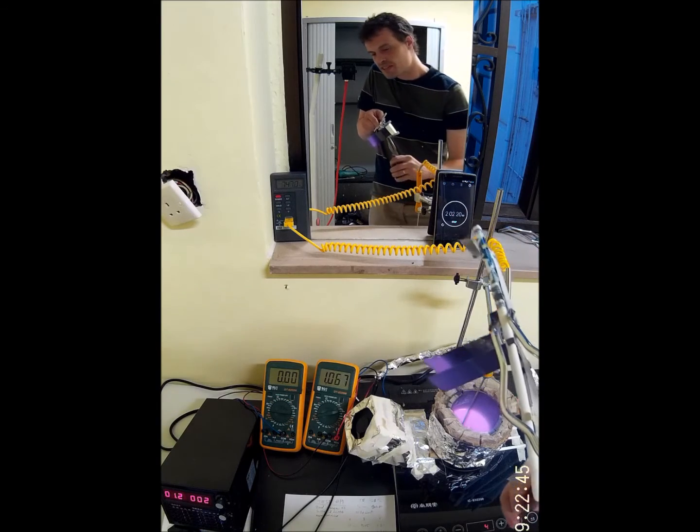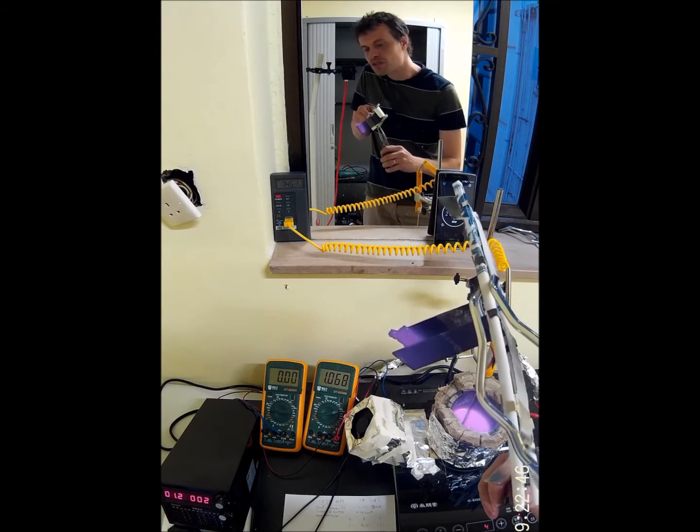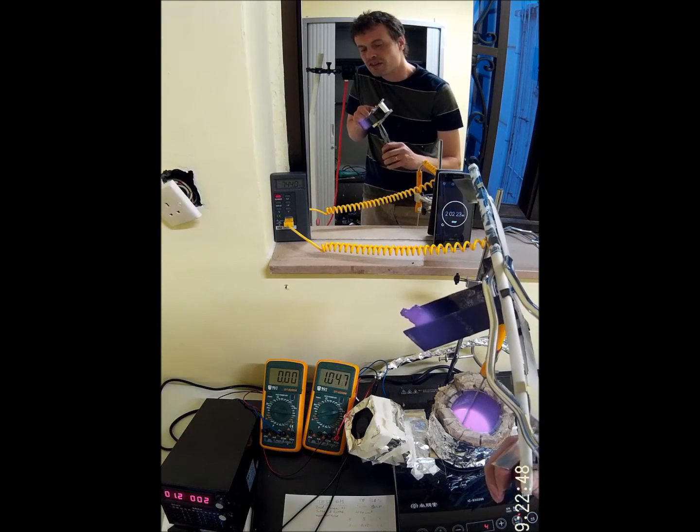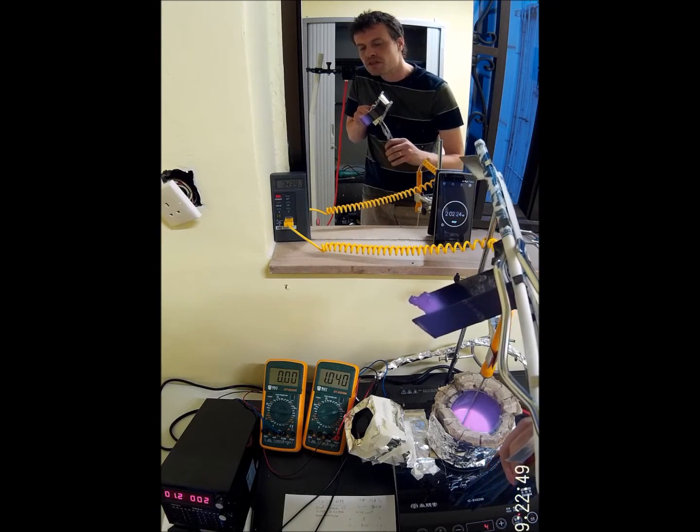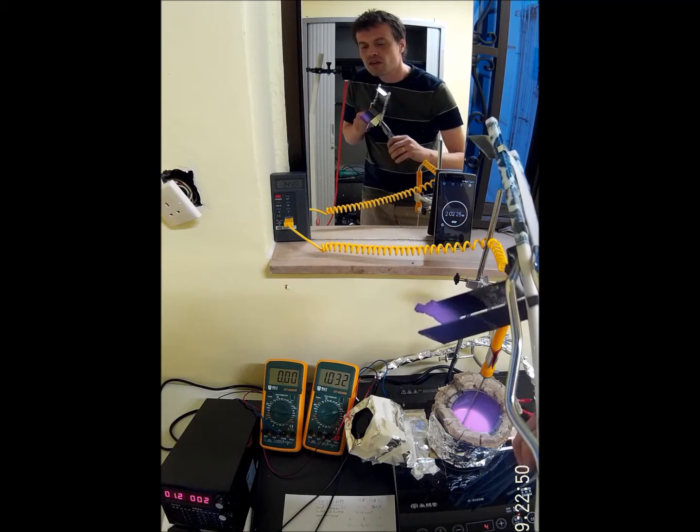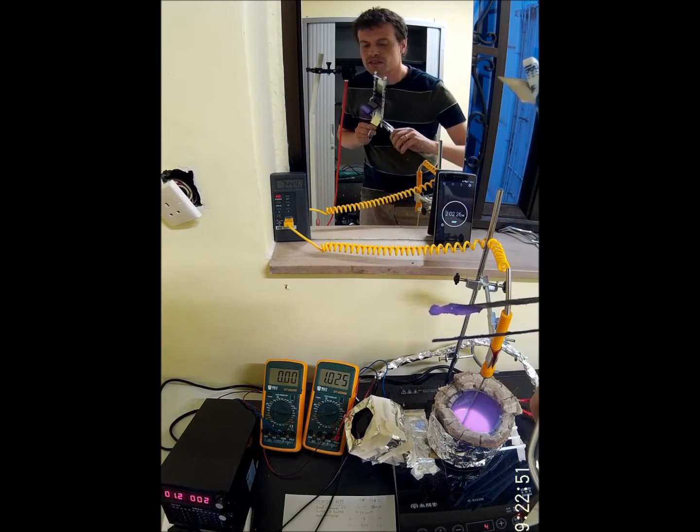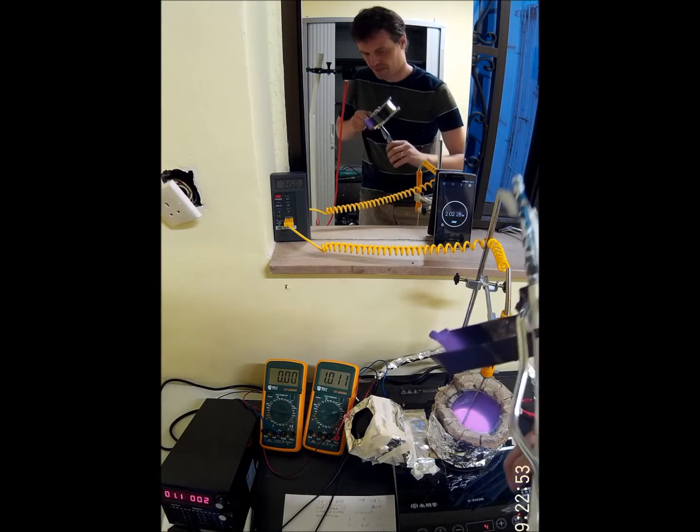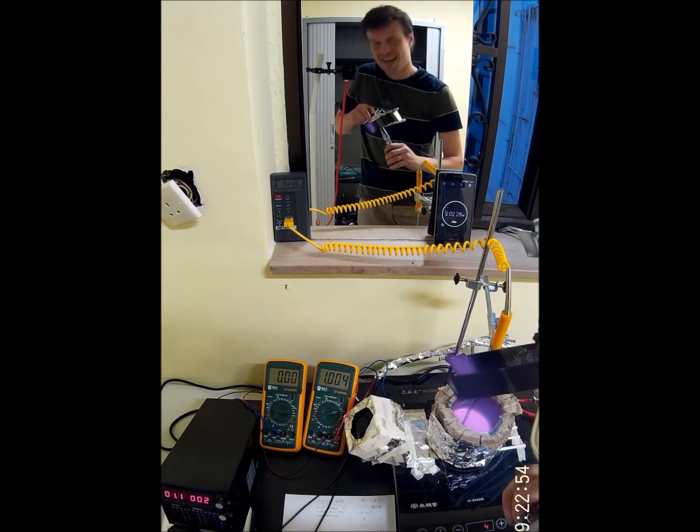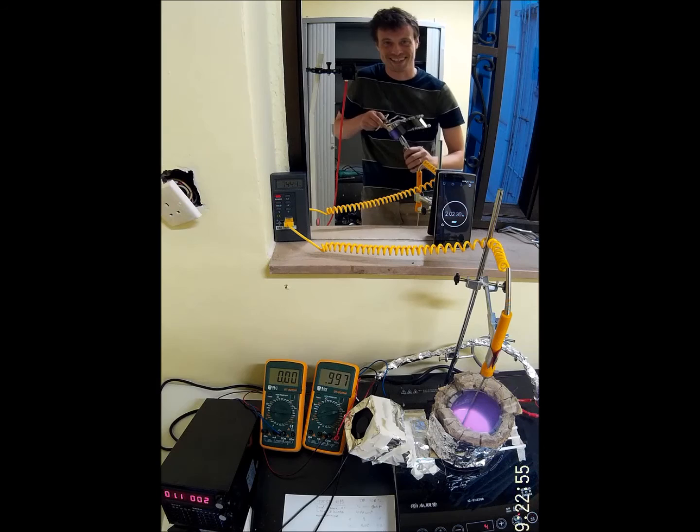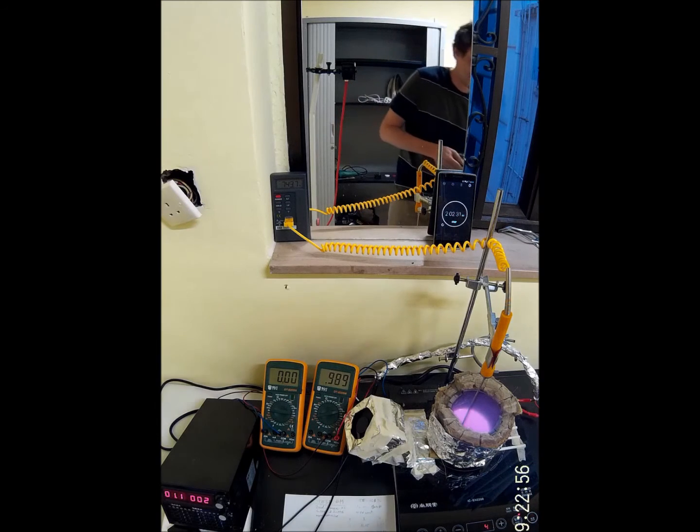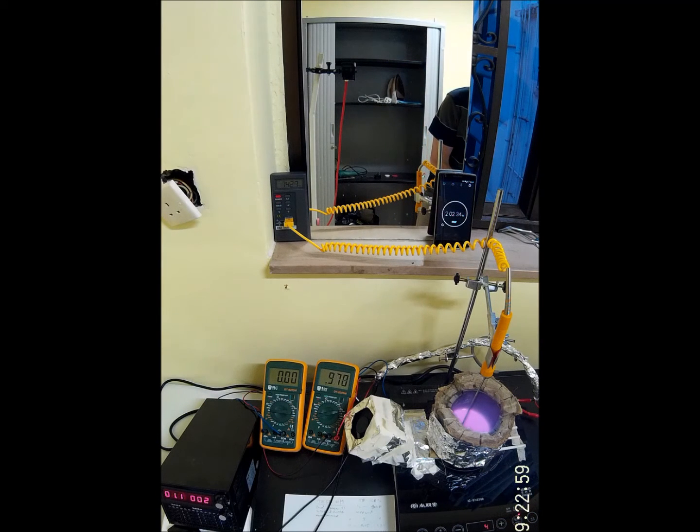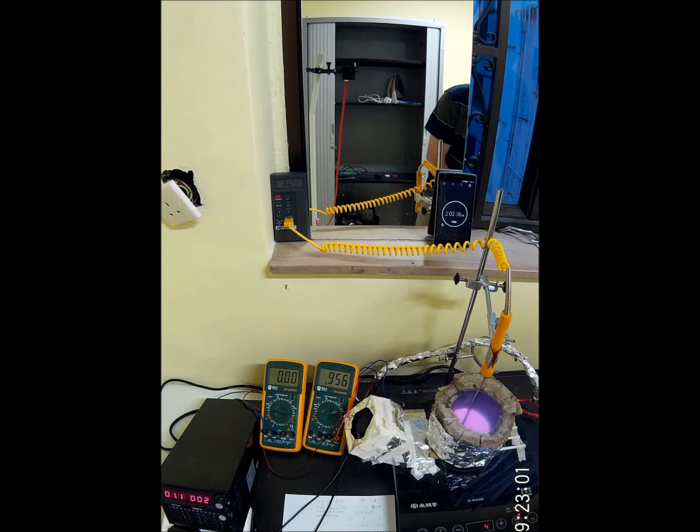There it is, red-hot carbon on the cathode, looking nice, good layer. Put this here to cool, inside here.